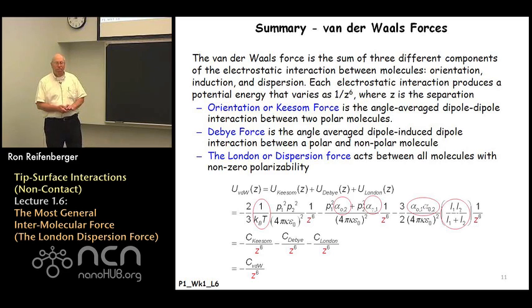I guess it's appropriate to sum up what we've discussed in the previous 2 lectures. What we've tried to work through is a systematic understanding of the interaction potential energies that occur when atoms or molecules interact one with respect to another by either dipole-dipole interactions between 2 polar molecules, by dipole-induced dipole interaction between a polar and a nonpolar molecule, and in this particular lecture, when both molecules are nonpolar, they have no permanent electric dipole moment.